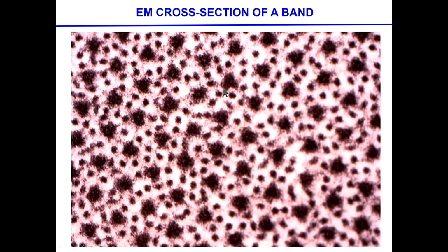This is supposed to be, however, for the EM. The EM doesn't use any of this stuff. It uses a number of other things which are particular, again, they're not holy water, so they might modify the structure. So if you had the time, and I'm sure you don't have to study anything else, you have plenty of time, just spend some looking at the little filaments and see how many you see, because you can see in many cases more than 6. And I spent some time trying to do that, and in the majority of the cases, you see more than 6 because of what I just said.